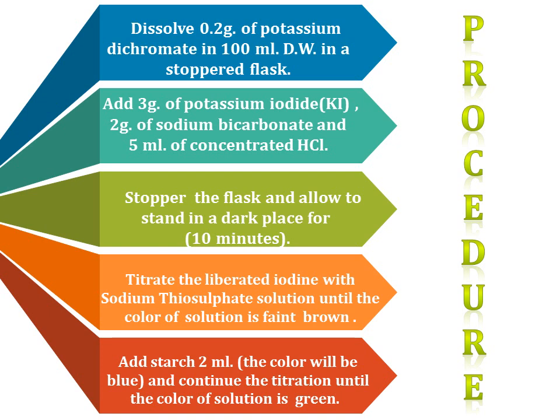Starch cannot be used as indicator in the following conditions. When I have a high concentration of iodine, I cannot add the starch. When I have very low pH, meaning a very high concentration of acid. When I have very high temperature: if the reaction needs heating, I must cool the solution and then add the starch as indicator.